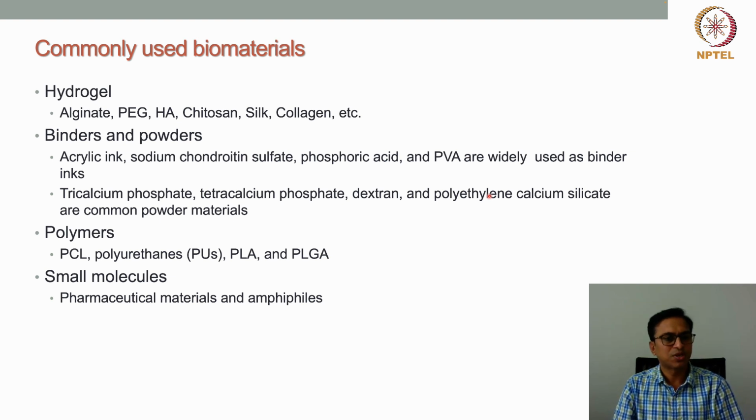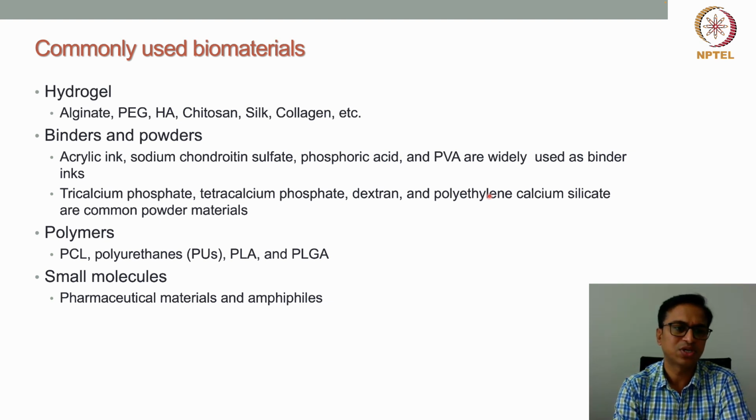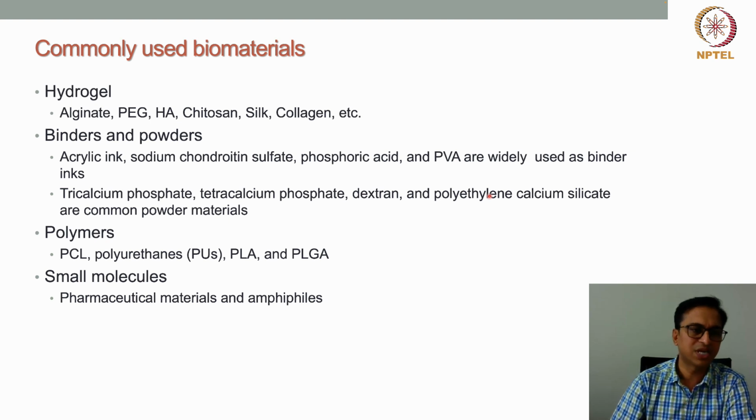Those are most commonly used for inkjet 3D printing, and there are many other biomaterials that are also being used, but these are the major classes of biomaterials that are used.